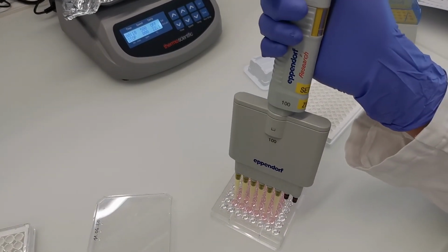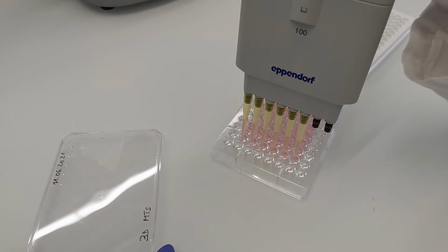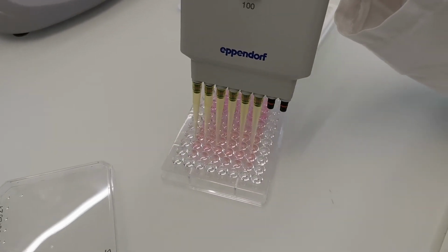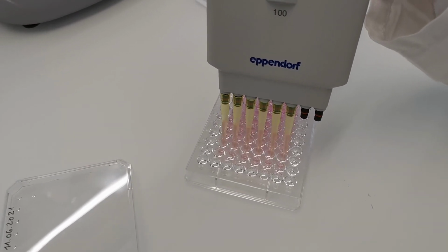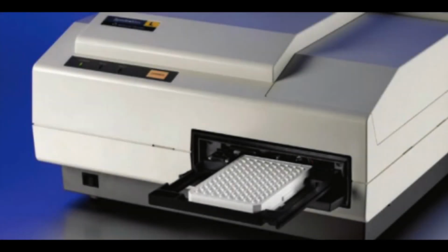The lysate is transferred to an opaque plate to prevent the wells from interfering with one another. The luminescence is then measured on an appropriate plate reader. Background luminescence is removed by measuring a well that contains no cells.